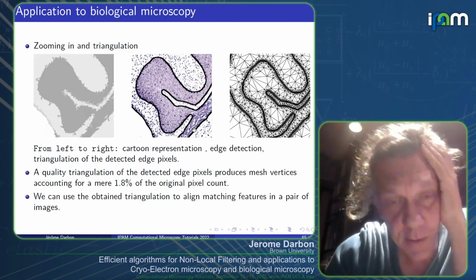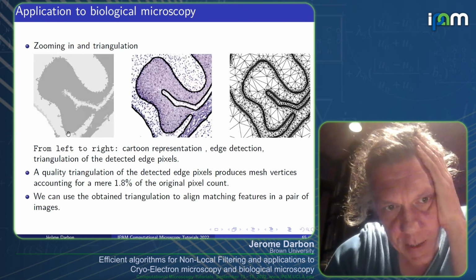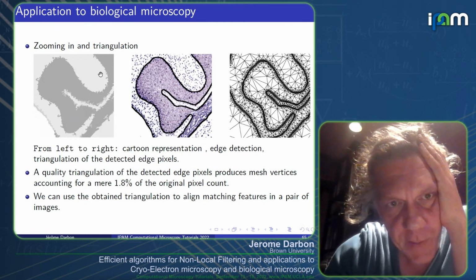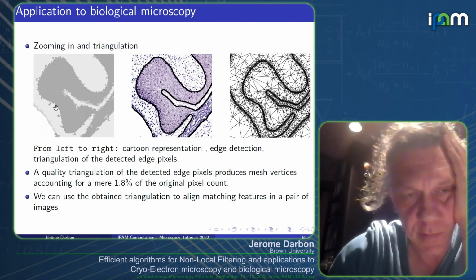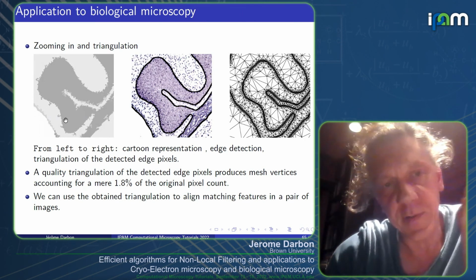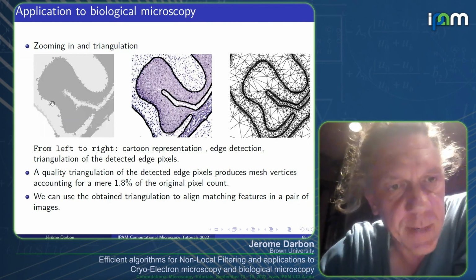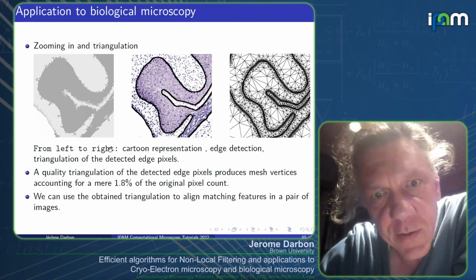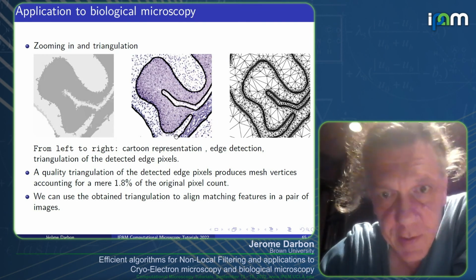And from here, we can zoom in and see that, since I used level set trees, I removed some noise, but my boundaries will be noisy because I used a strict connected component algorithm to define my topology. In order to get the edges, you simply need to use a Canny filter, and then you get a very precise boundary of where the edges are.